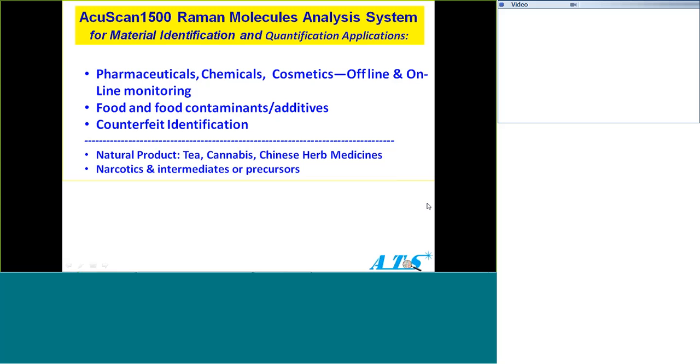Yes, I understand. Through the bag, yeah. So you don't have to take the material out of the bag, unlike HPLC, where you have to take it out. Blister packaging or the bag, as long as you have transparent plastic, it's okay.